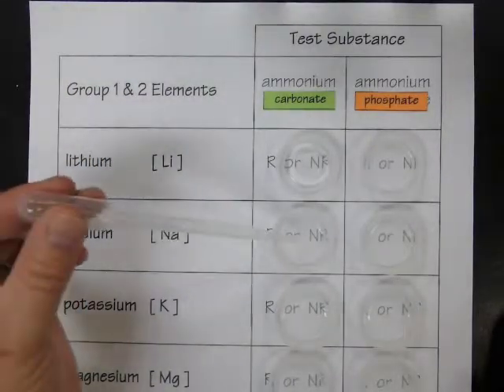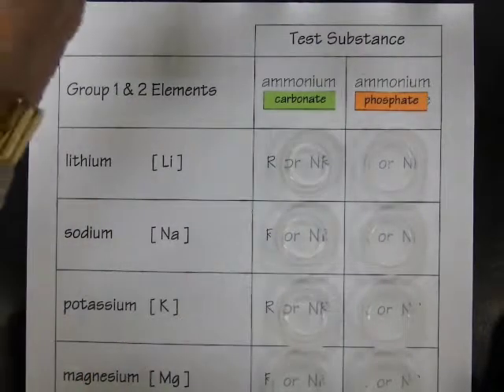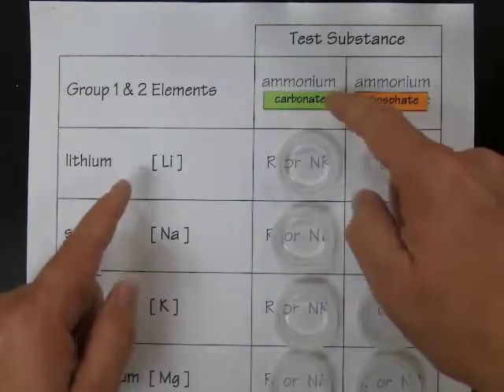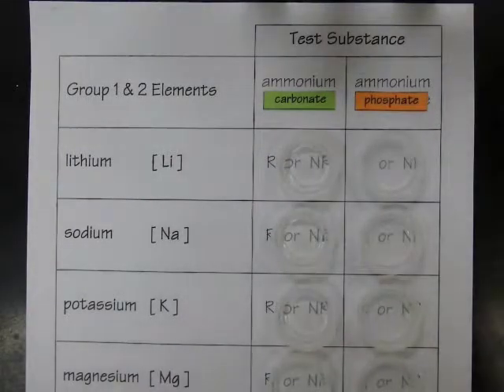Carbonate, carbonate, and carbonate. Okay. According to what I see here, there's no reaction, there's no change in the appearance of these mixtures. The lithium and the carbonate, the sodium and the carbonate, potassium carbonate, no reaction. Try that with the phosphate.